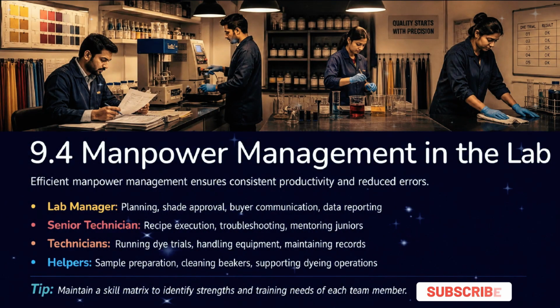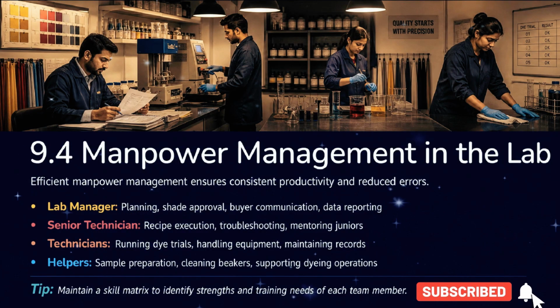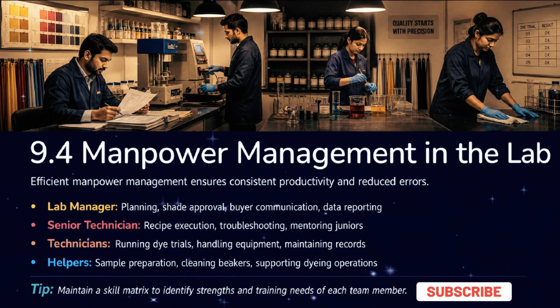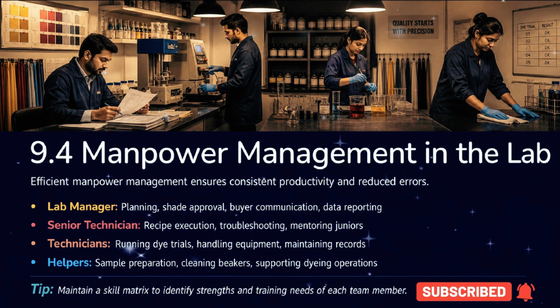Effective manpower management is vital. Clearly define roles. Managers oversee operations, senior technicians handle complex tasks and mentoring, technicians run trials, and helpers provide essential support. A skill matrix can help identify training needs.